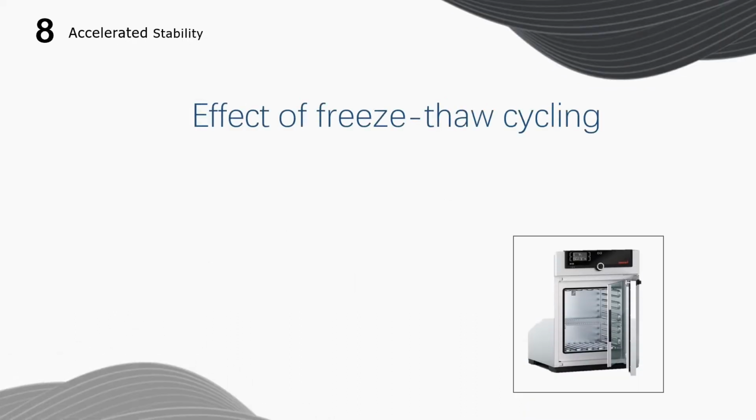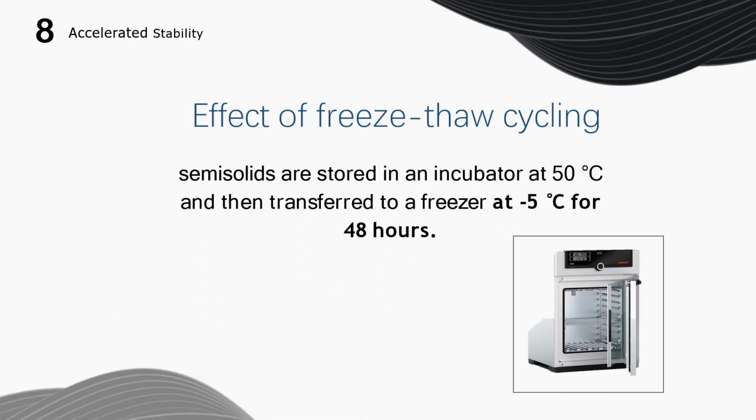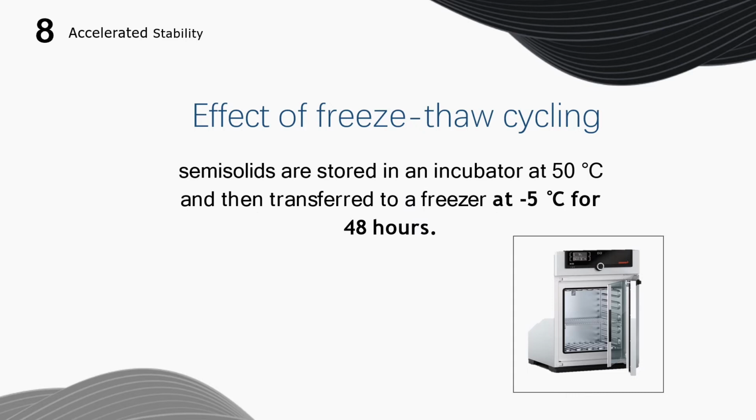Effect of freeze-thaw cycling. Semi-solids are stored in an incubator at 50 degrees Celsius and then transferred to a freezer at -5 degrees Celsius for 48 hours.